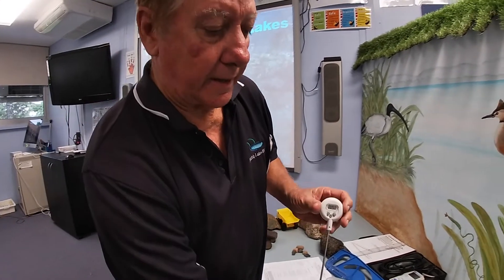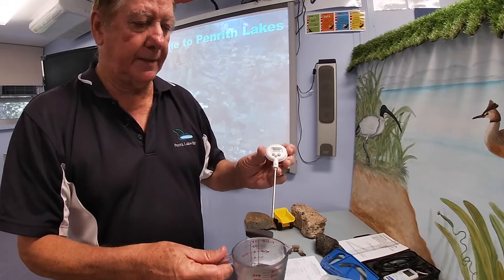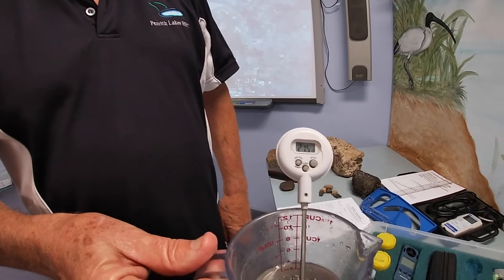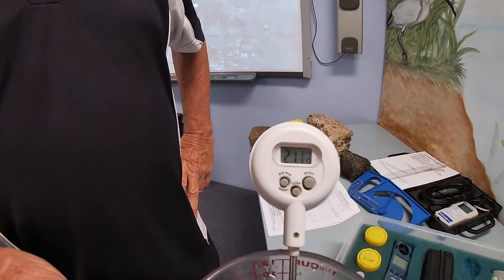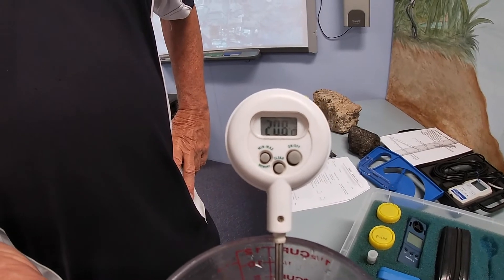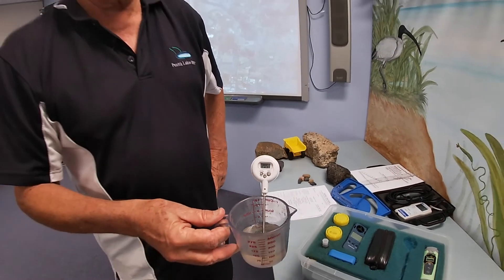We get a sample of water from the bucket and simply put the thermometer into the water. The temperature reading will settle after a while, and once it settles we simply record the value. It's a very simple test to do.